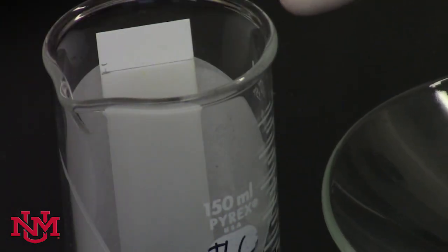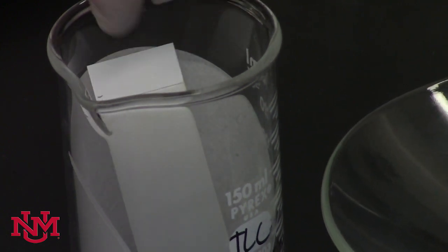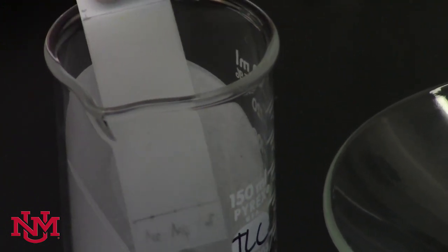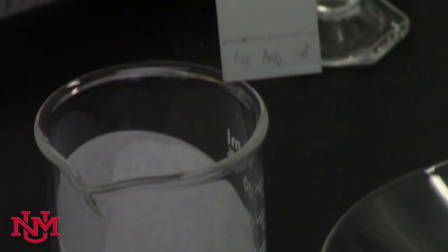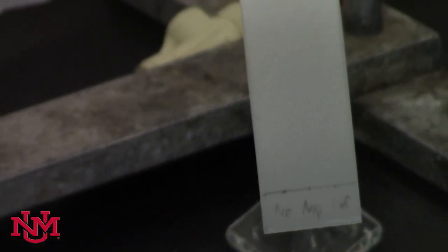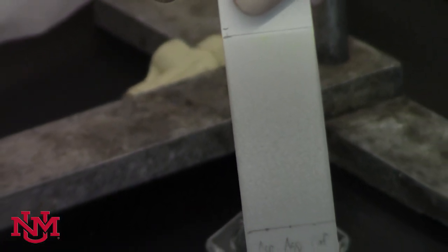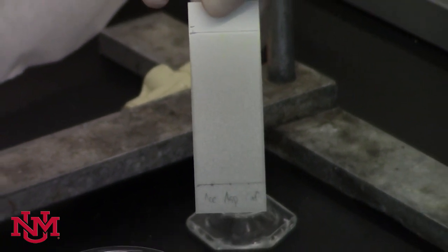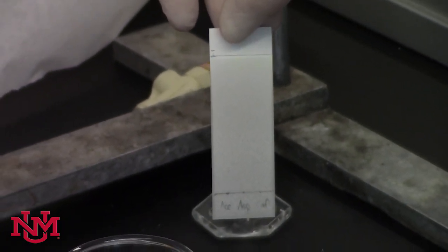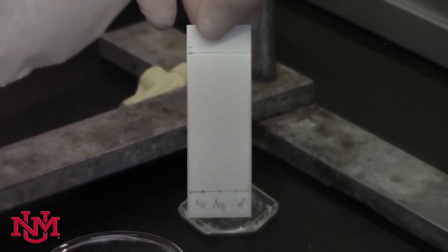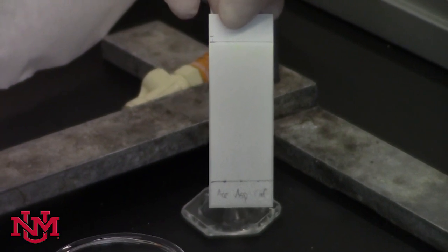When the solvent front reaches the top line, remove the TLC plate as carefully as possible. Hold it vertically a little bit so that it dries. Since this solvent has a little bit of acetic acid, you're going to need to wait a little bit in order for it to dry, and then we'll go back to the UV lamp and visualize the TLC plate.